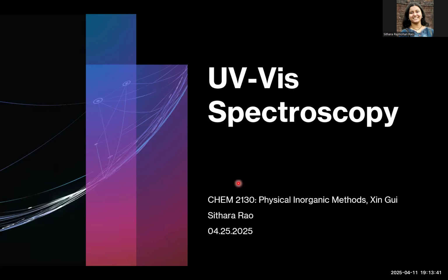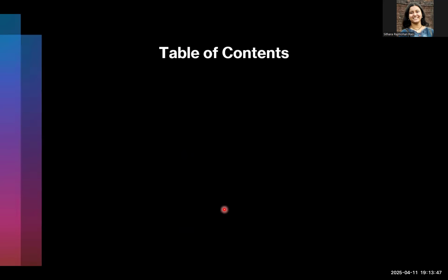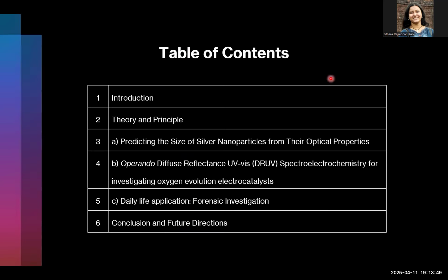Okay, so the spectroscopic technique that I'm going to be talking about is UV-Vis spectroscopy. Here is the table of contents, and let's go through it one by one. Starting with the introduction to UV-Vis spectroscopy.